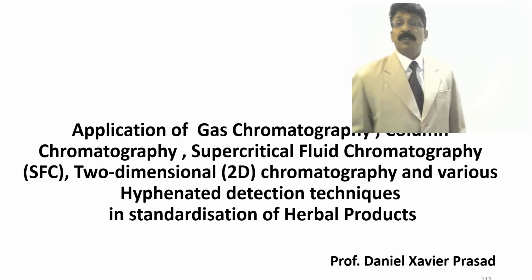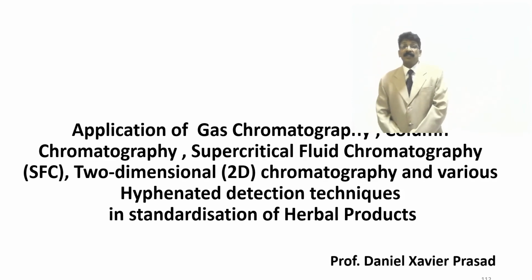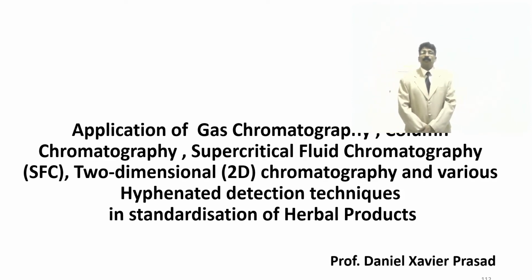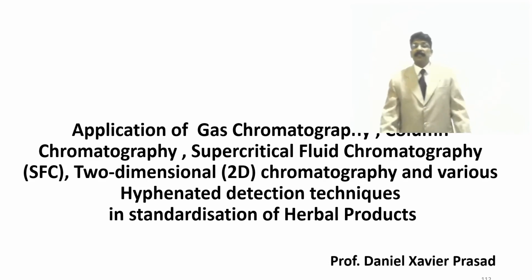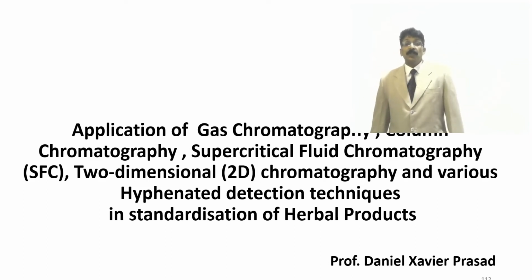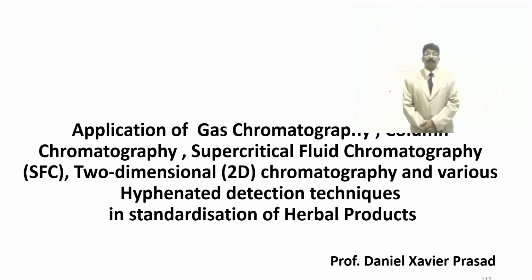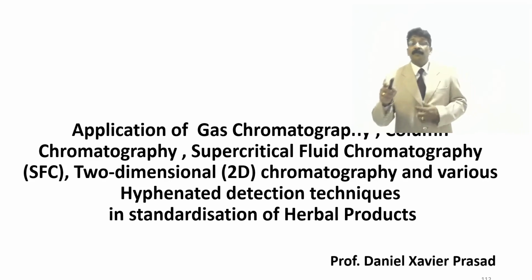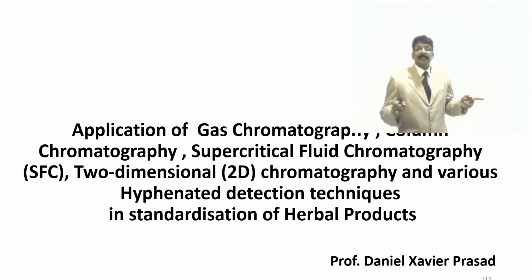So today what we are going to see is a short application of gas chromatography and column chromatography, and supercritical fluid chromatography, SFC, and two-dimensional chromatography. What is two-dimensional chromatography? And various hyphenated detection techniques.